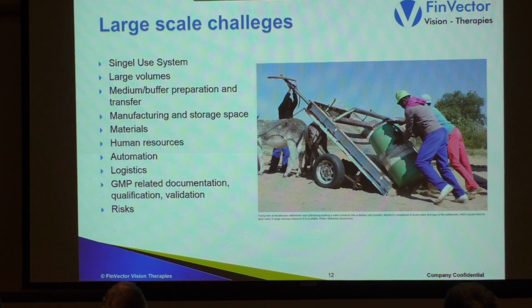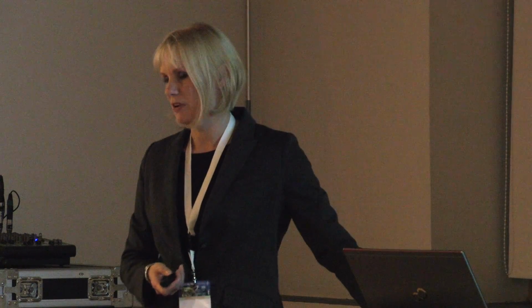If we are having now in our facility 500-liter media and buffer tanks, it's already quite heavy for the operators to work and push all the media. Or can you build a system that you don't need to push the tanks around your GMP facility? Can you rely on the pumping system? But this you need to be thinking when you are preparing and developing your process.